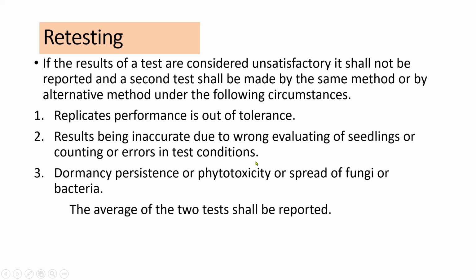So inaccuracy in evaluating the seedlings, errors might happen at any time. Also dormancy, persistence, or phytotoxicity, or spread of fungi or bacteria. When unexpected fungi and bacteria intrude into the seed germination test, we also have to take care of this, reconsidering the seed germination test.